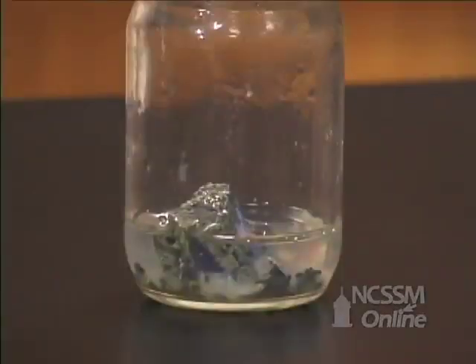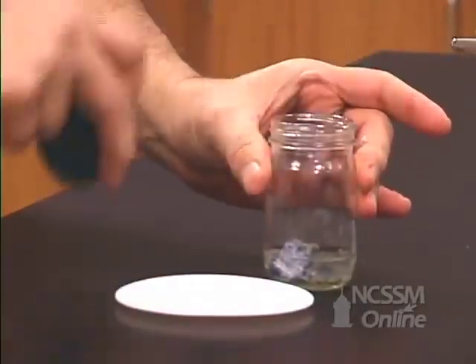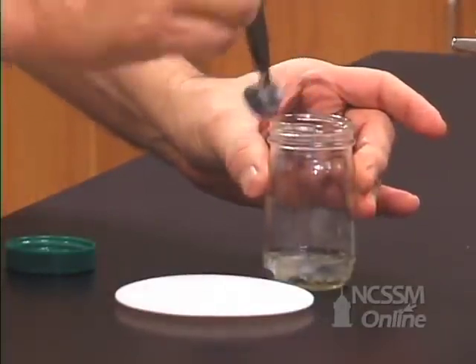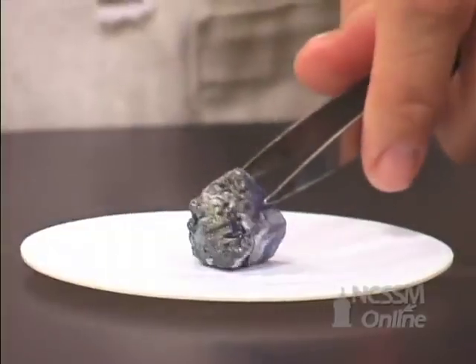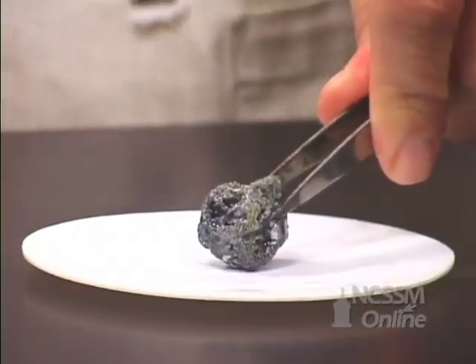If we continue down the column to potassium, we see that the potassium metal is also stored under mineral oil to minimize its reaction with the oxygen in the air. If we remove a piece of potassium metal, we can see that the potassium is coated with a gray coating of the oxide.